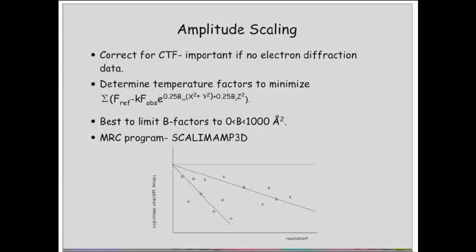And you can scale roughly against those reference data. You might typically end up applying temperature factors, let's say, of something like -500 to bring these slopes up to the horizontal. That would be, let's say, at 7 angstroms, I think the equivalent of increasing the amplitude by a factor of 12 or something. So you're basically sharpening up the high-resolution data.